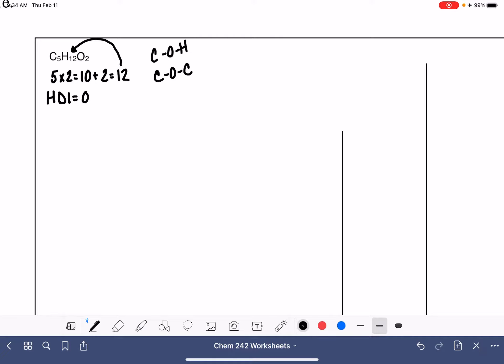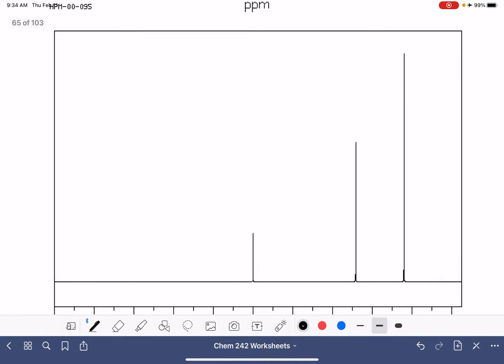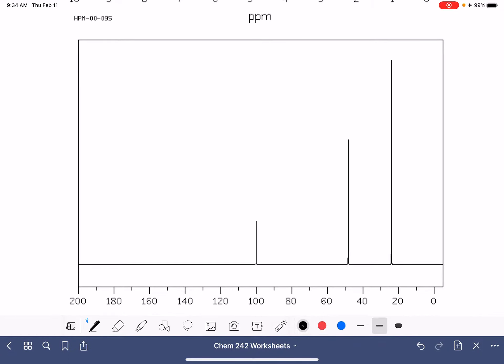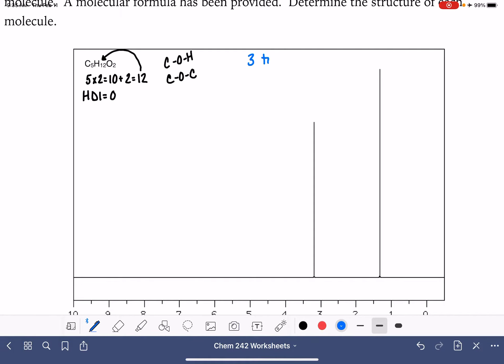Let's go down to the carbon NMR first. Carbon NMR is never going to show us integration, and it's also never going to show us splitting. All we can tell from the carbon NMR is the number of peaks, which corresponds to the number of types of carbon atoms. We have three peaks — three different types of carbon atoms. We can also get information about chemical shift from carbon NMR, but right now we don't need to think about that.